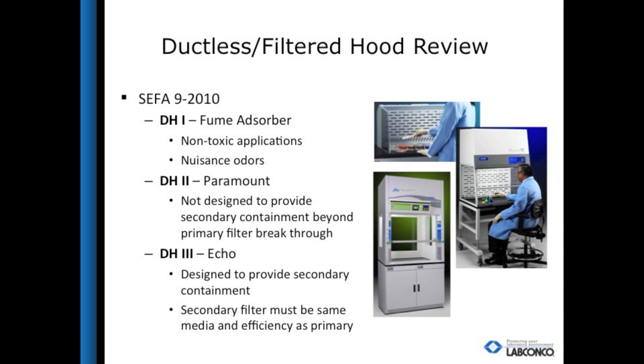SEFA is the Scientific Equipment and Furniture Association. They are an organization that has definitions for different types of ductless enclosures and fume hoods. DH1 hoods are to be used with nuisance vapors only, as they are not required to have a sensor to tell the user if there is chemical breakthrough. DH2 hoods go a step beyond and do have a sensor, however they are not designed to provide secondary containment beyond the primary filter breakthrough. DH3 hoods are at the highest level in the ductless hood category. The Protector Echo falls into this category, and to differentiate it from other ductless enclosures, we call it a filtered fume hood.